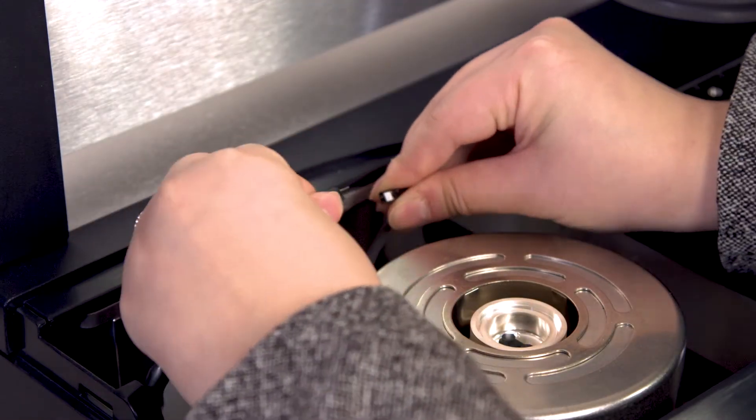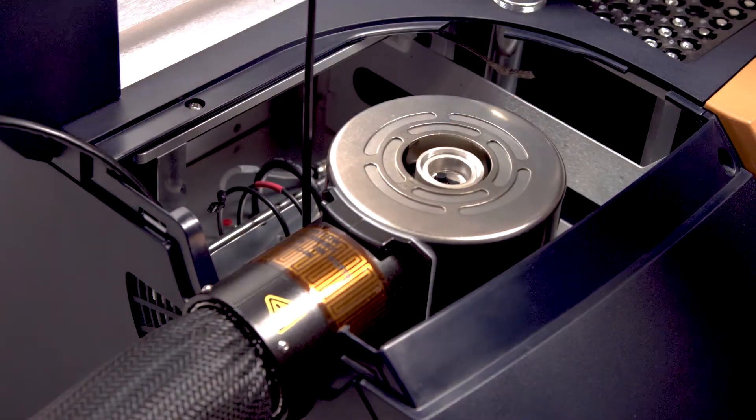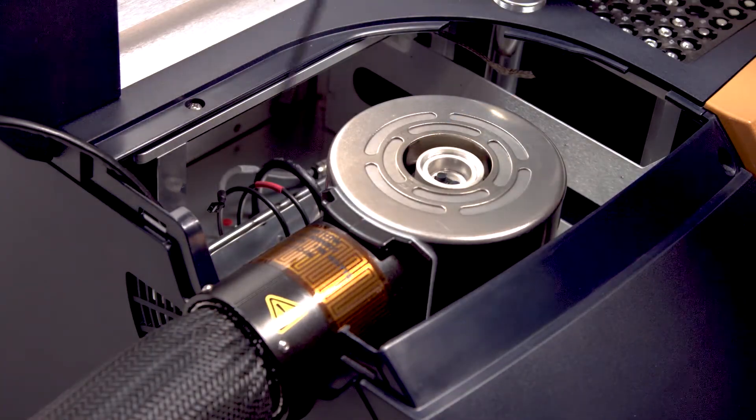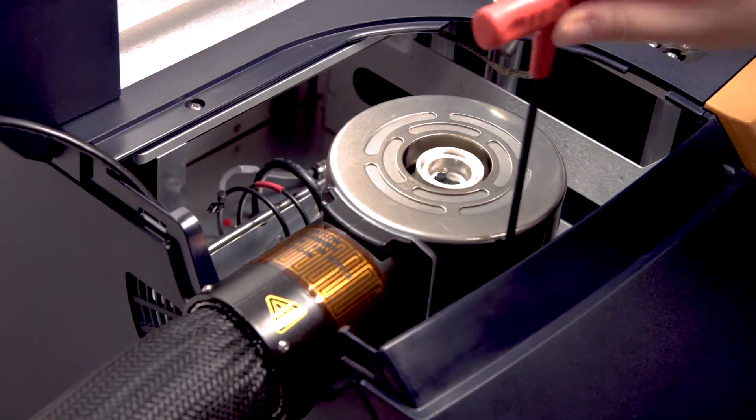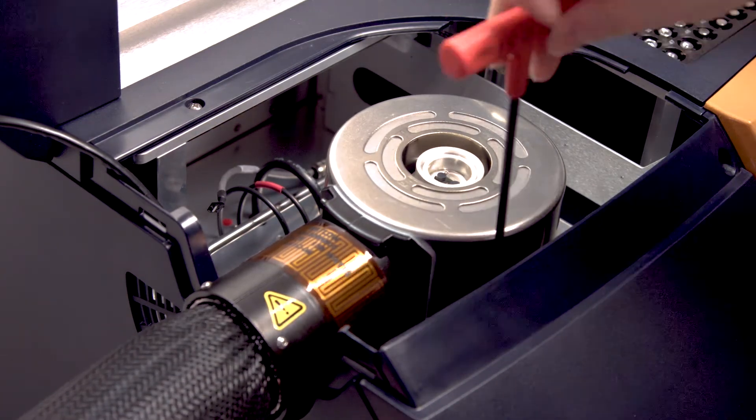Disconnect the small connection cable of the cooling head heater. Use a 5/32-inch Allen wrench to unscrew the three screws on the cooling head. Alternate around the cooling head and partially unscrew each one.